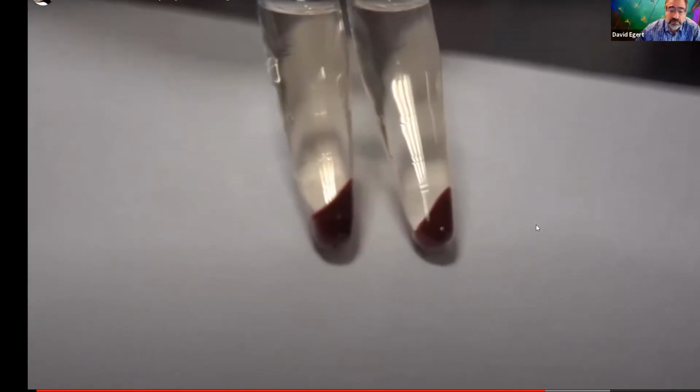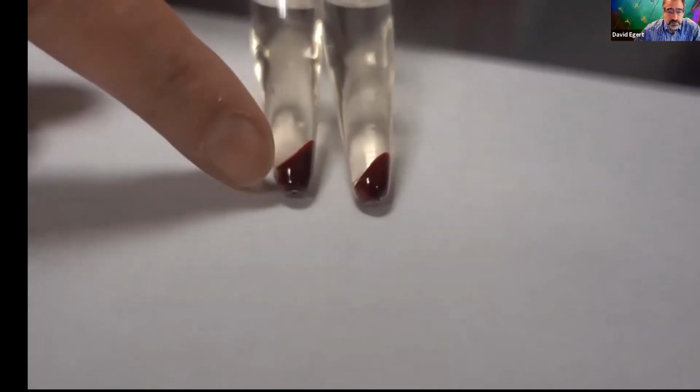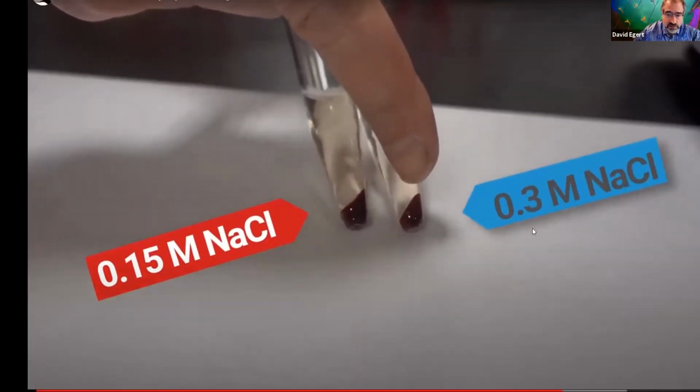Different size pellets. When I was talking about the raisins, think about the grapes. These both have exactly 6 drops of blood, the exact same number of blood cells in them, but the amount of space that those blood cells are taking is different. And this is our first clue that these cells here probably crenated compared to these, because they're not taking up as much space for the same number of cells.